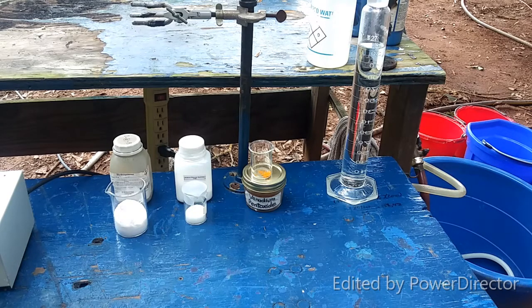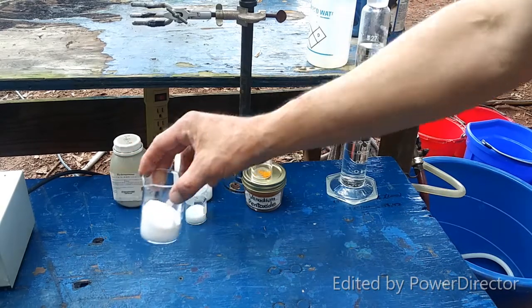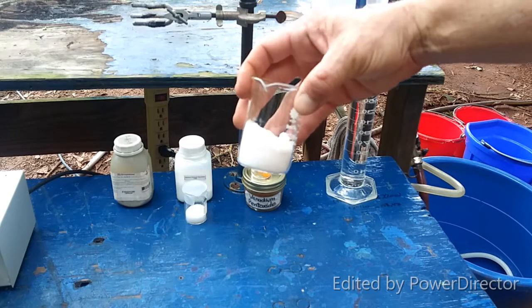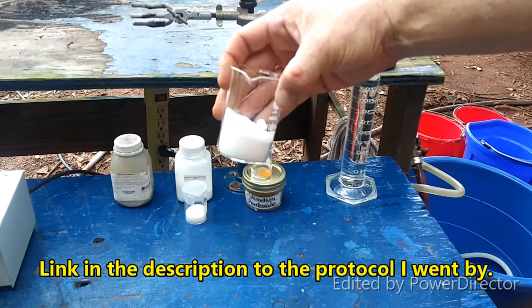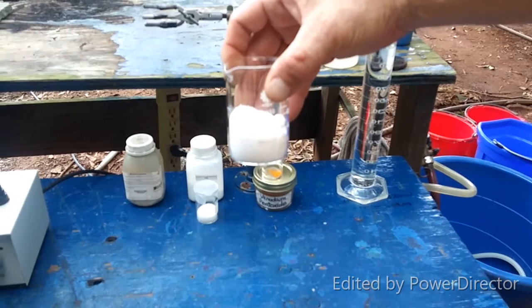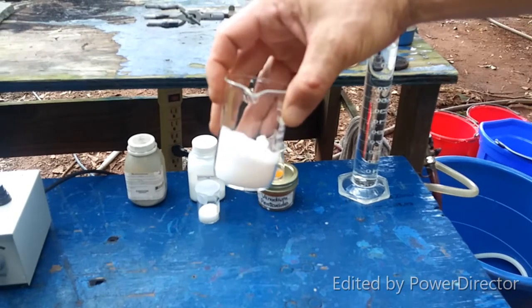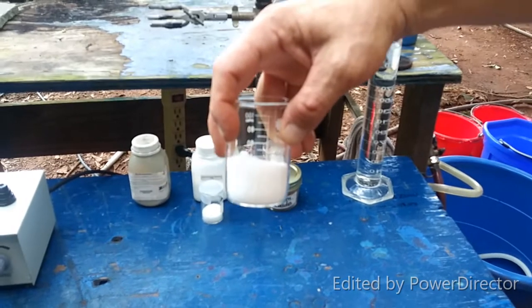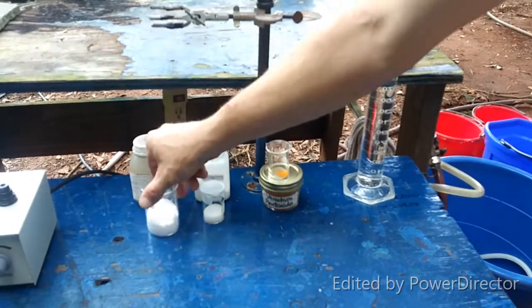Alright everyone, this is everything we need for our reaction. I've scaled this down to one-quarter of what the reference calls for. This is 27.5 grams of hydroquinone — like so many organic compounds, it's kind of boring and colorless.